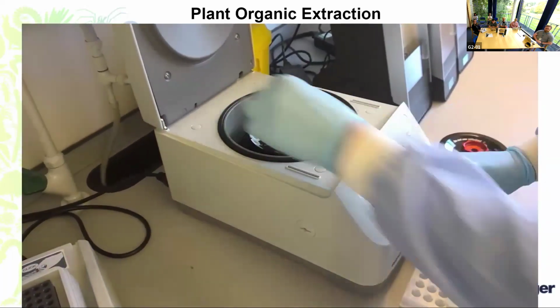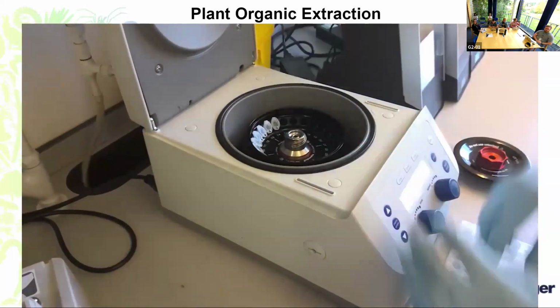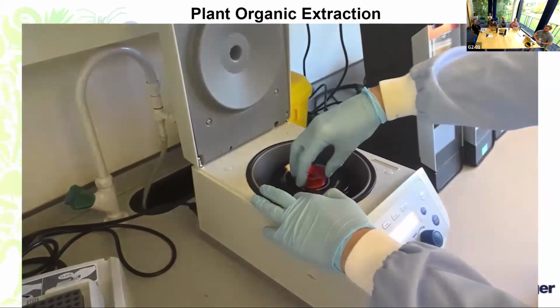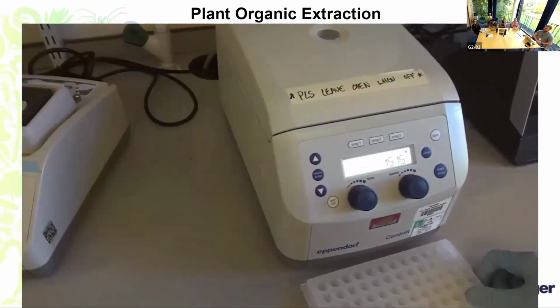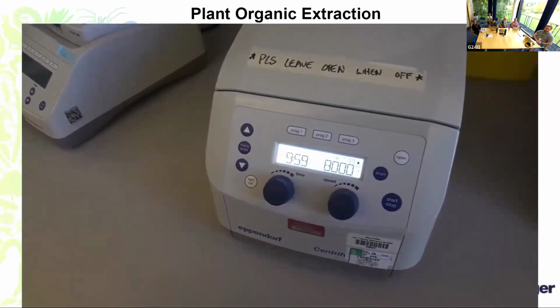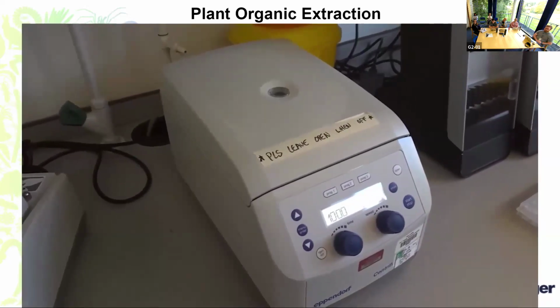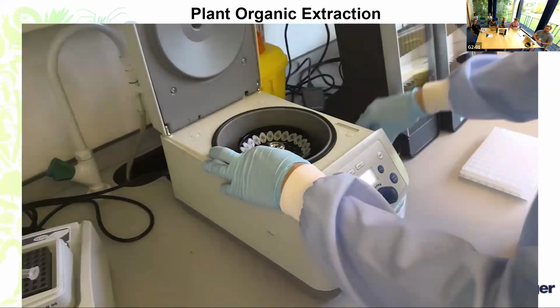Obviously, plants are extremely diverse, so a range of changes can be made to this protocol depending on the phenotype we're working with. Things like orchids, for example, have various contaminants that can carry over and inhibit long-read sequencing, while things like violets, for example, or the Calluna genus can have a lot of viscosity-inducing agents that can co-precipitate your DNA. So different adaptations can be made to this protocol, or various additives can be included, pre-lysis washes, for example, or additives to the lysis buffer that can be used to stop these detrimental characteristics that are often seen. But what's been shown here is the base protocol.